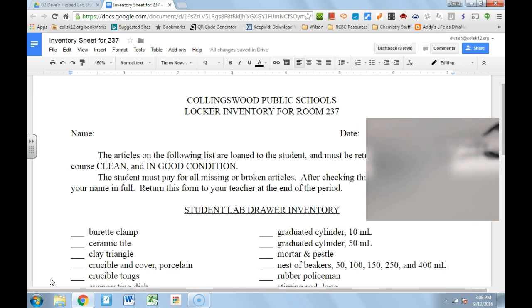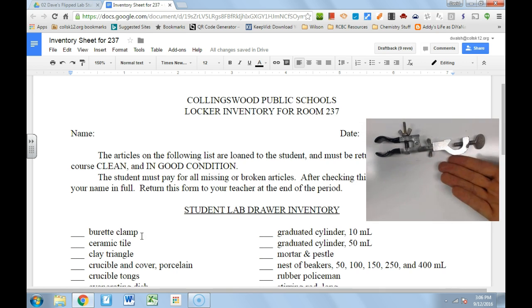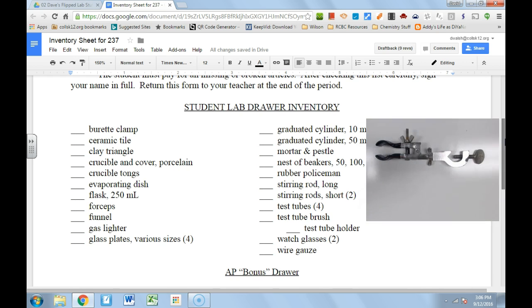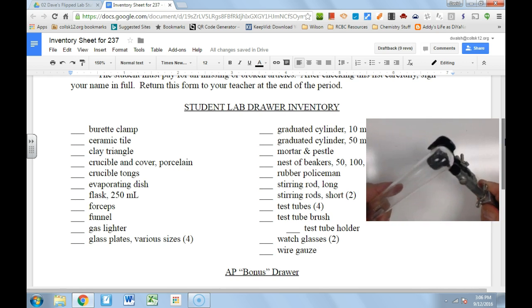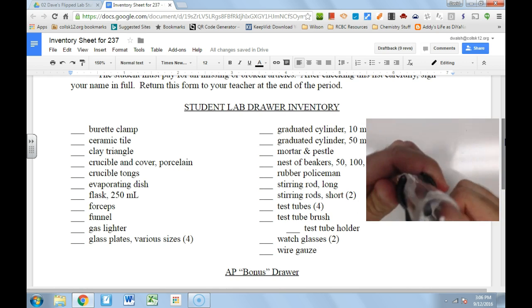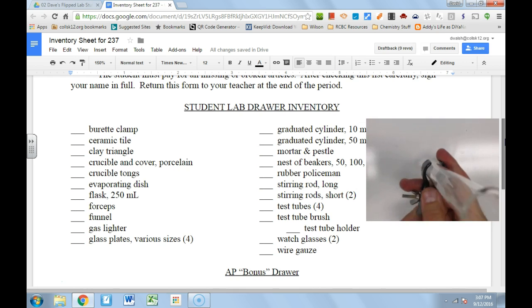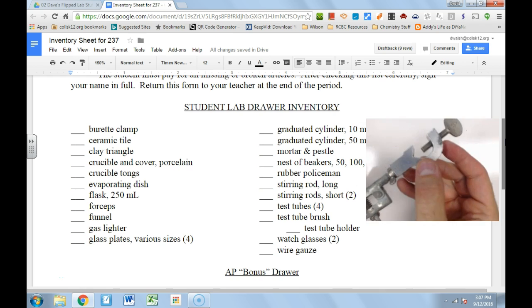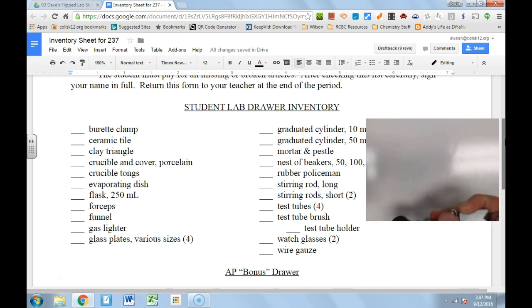So the first thing on the list is this burette clamp. The burette clamp is used to clamp things. You can take a piece of equipment, put it in here, tighten it, and support it on a ring stand in the lab. This is a burette clamp.